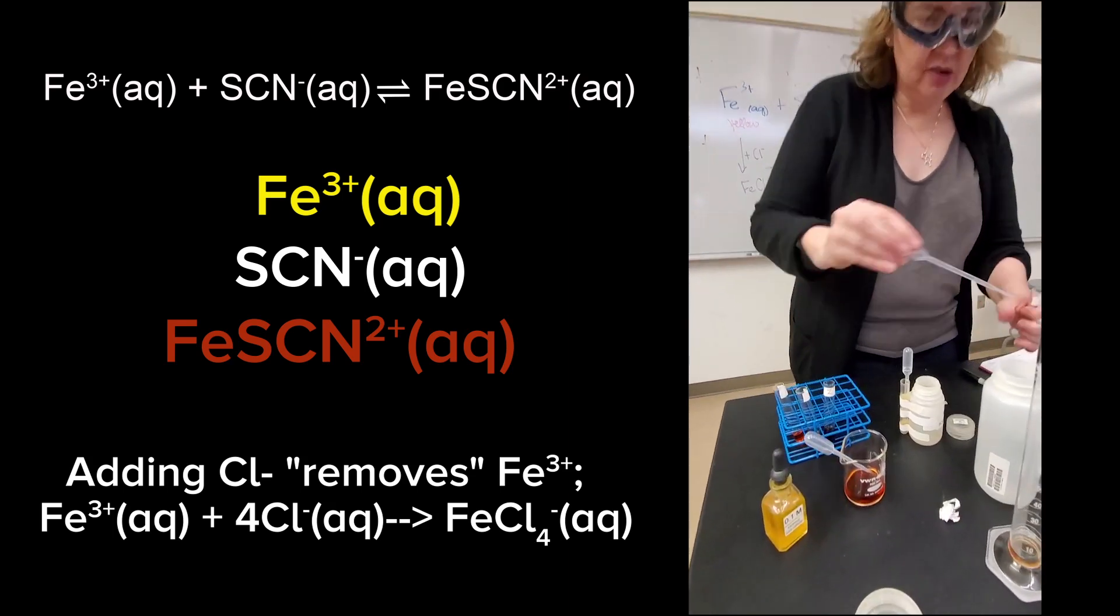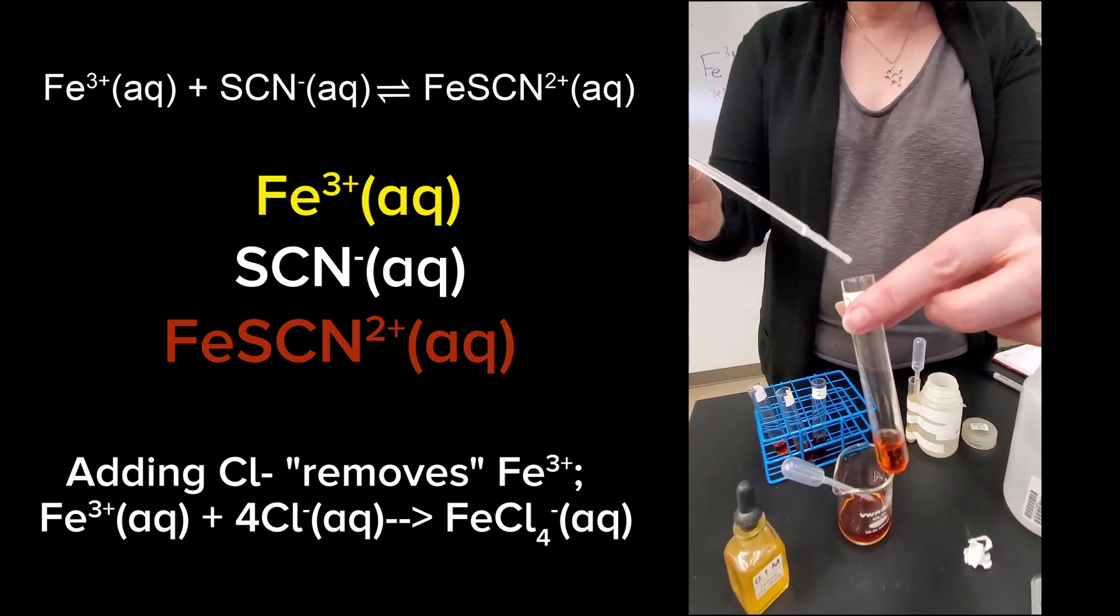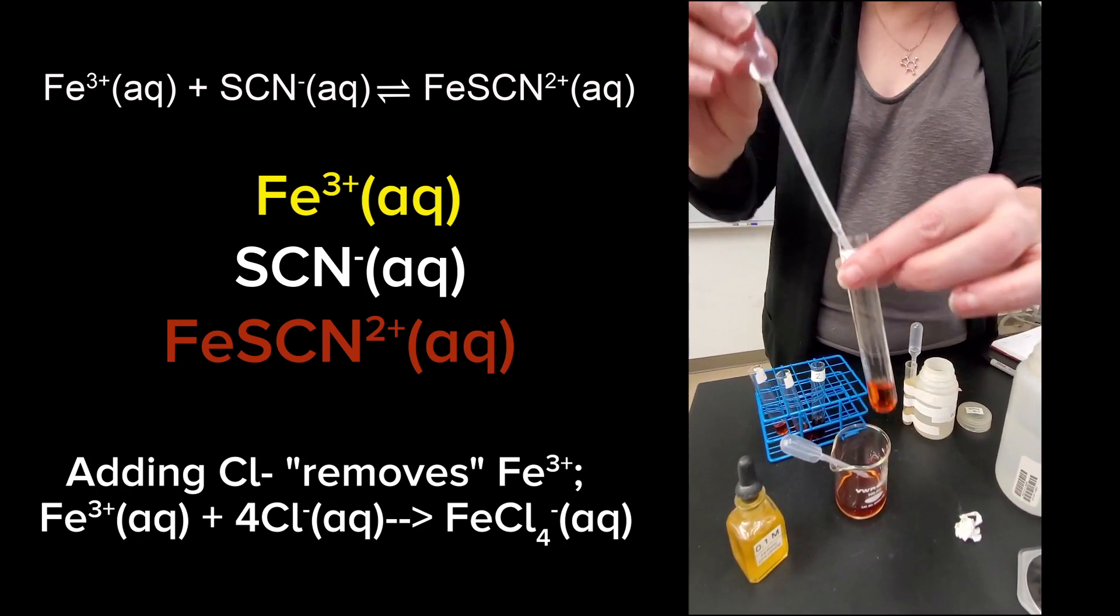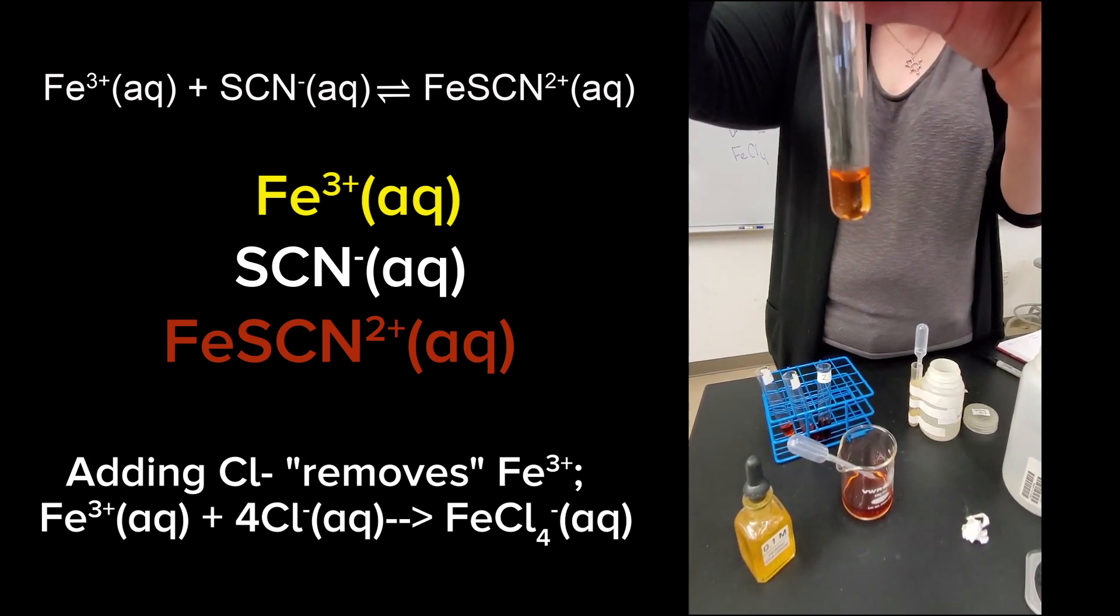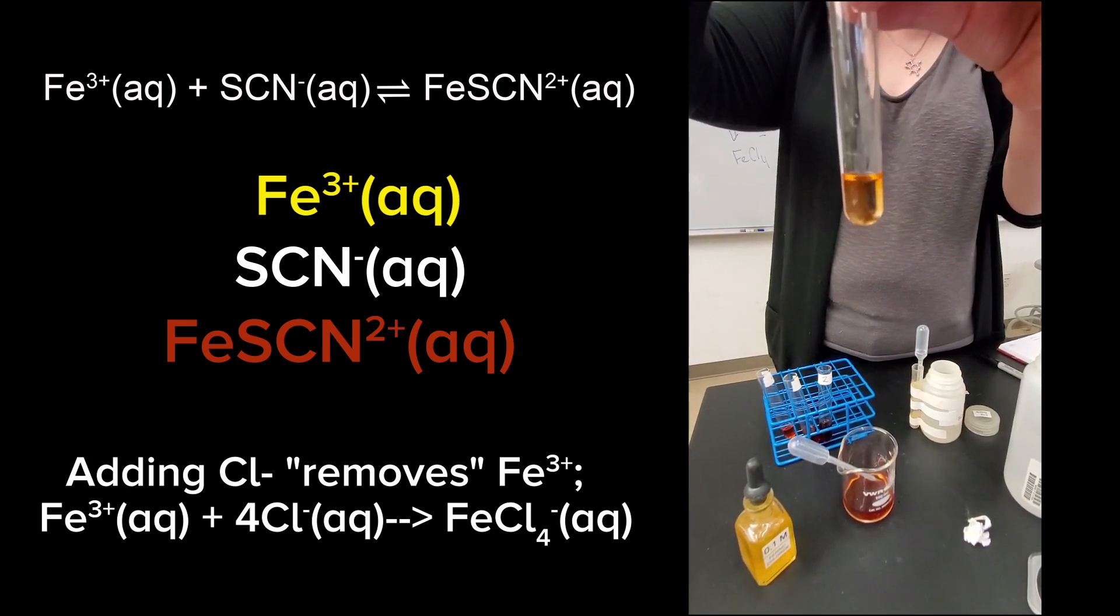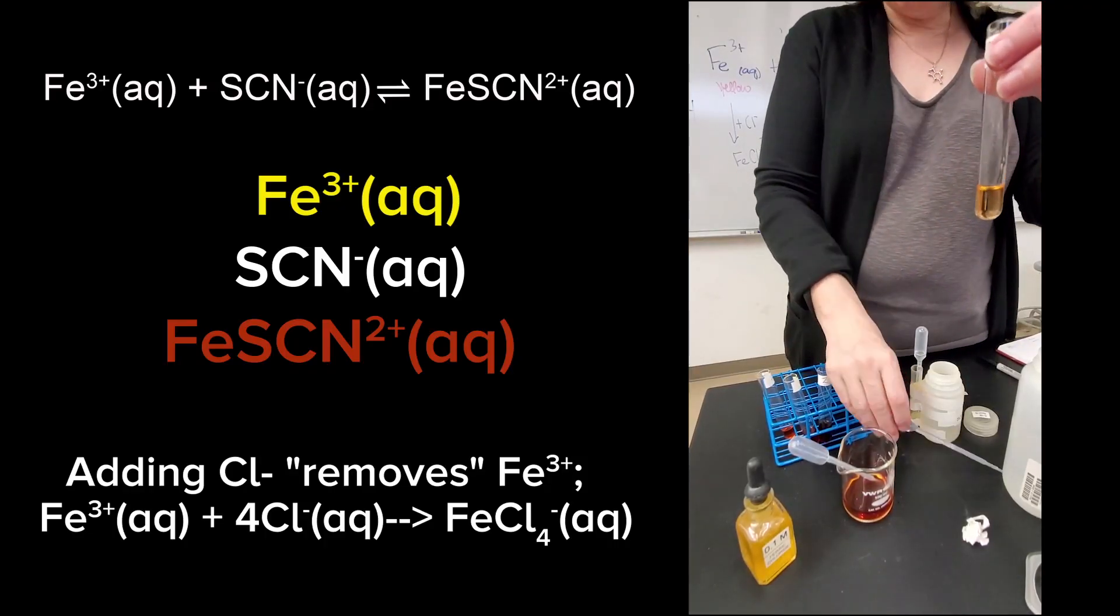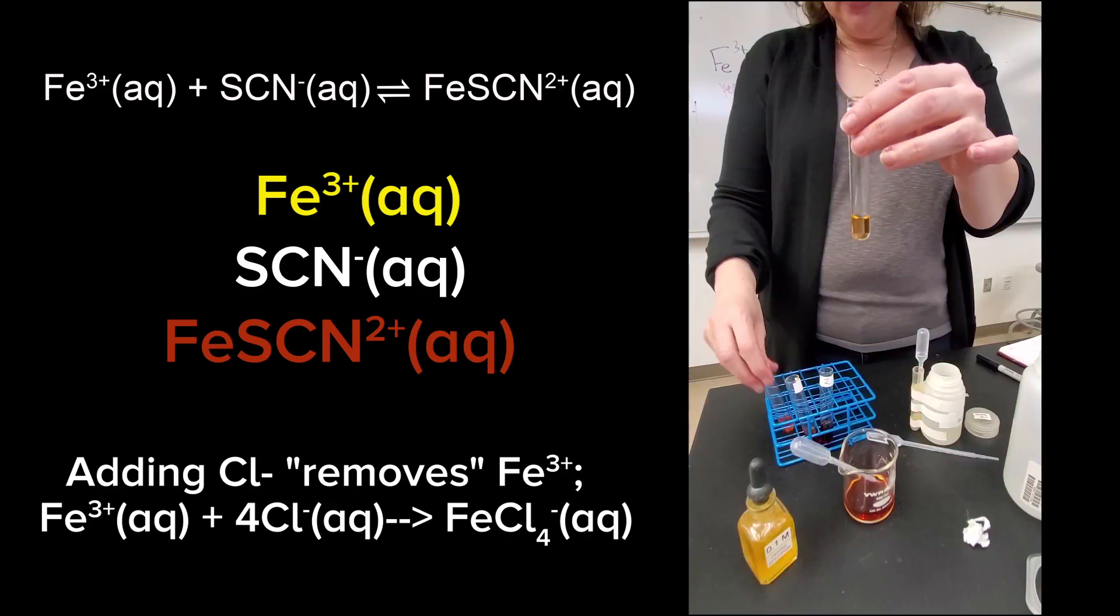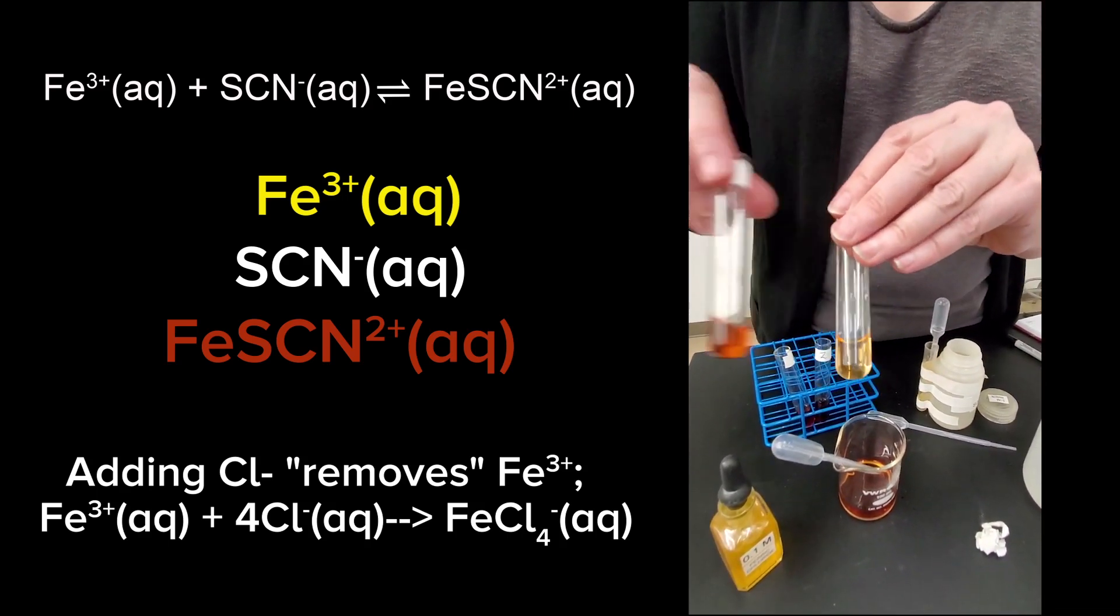So here we go. Here is my final test tube. Here's my saturated sodium chloride. I'm going to add, how much does it want me to do? Well, let's just add it until we see. A bunch of drops. One, two, three, four, five, six, seven, eight, nine. Okay. So there's my sodium chloride. And as we look, this was my control. There's way less of that orange red color.